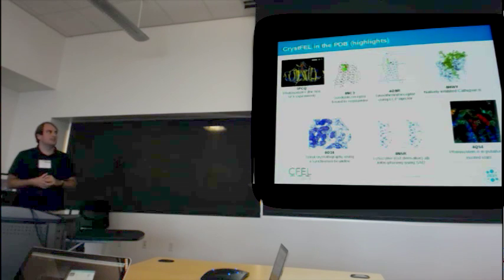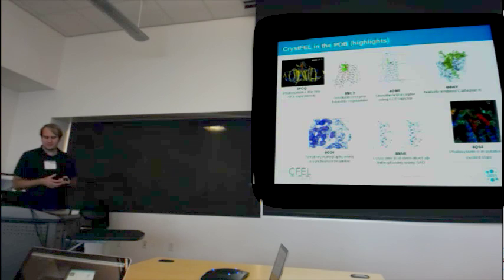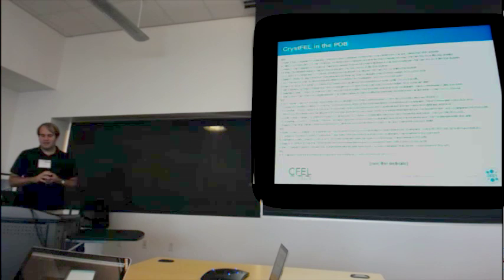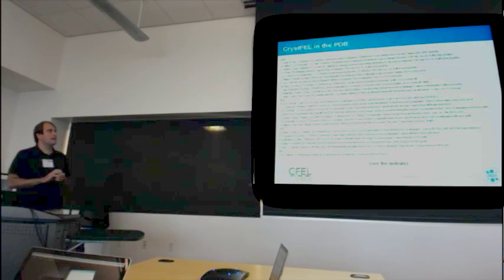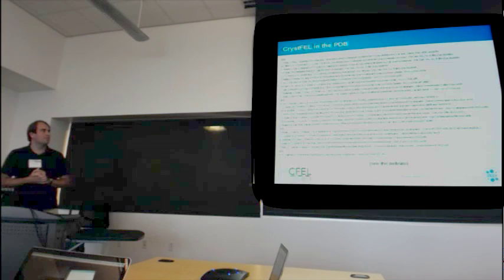So that's fantastic. Then there's a couple of GPCRs with ligands, solved using this lipidic phase injector. In fact, there's about this many. So this is just a list of references. This is all on the website, so if you want to read about these applications and how varied they are, you can just get these from the website. So that's the shameless advertising done, and indeed my talk. I hope you're looking forward to giving this a try tomorrow. Yeah, thanks very much.